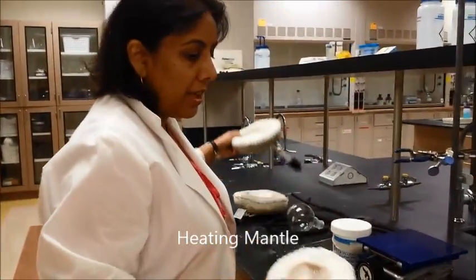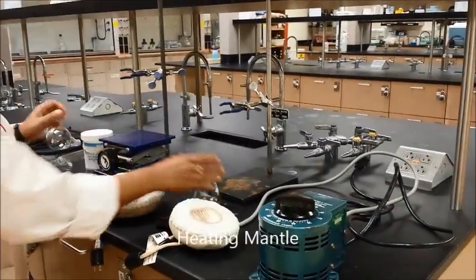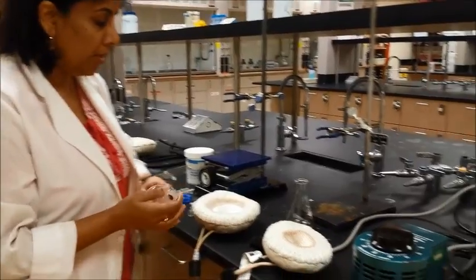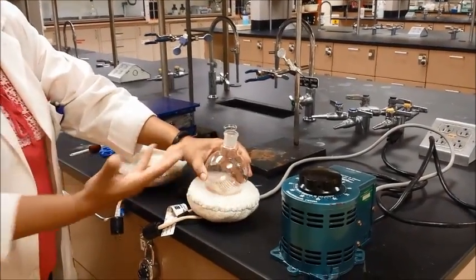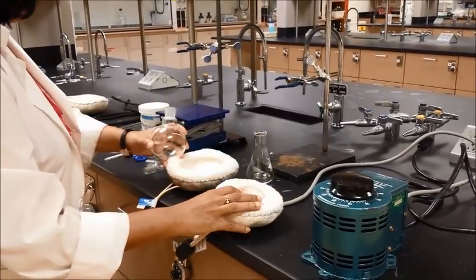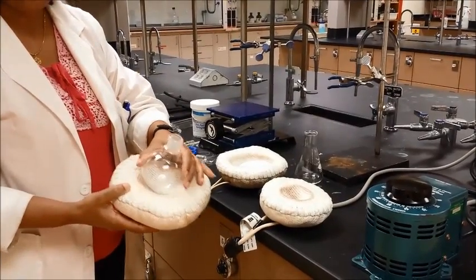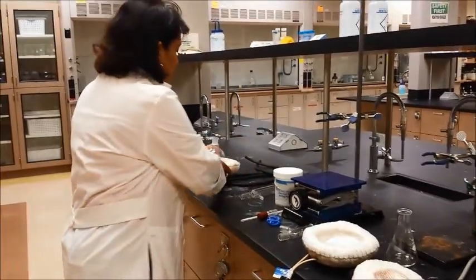A heating mantle comes in different sizes, so depending on what kind of round bottom flask you're using, you choose the right size. For example, if I'm using this 250 milliliter round bottom flask, this is going to be a lot better than using this one to allow for better heating. So I'm going to use this heating mantle, which will fit very nicely in the round bottom flask. So you get the right size of the heating mantle.